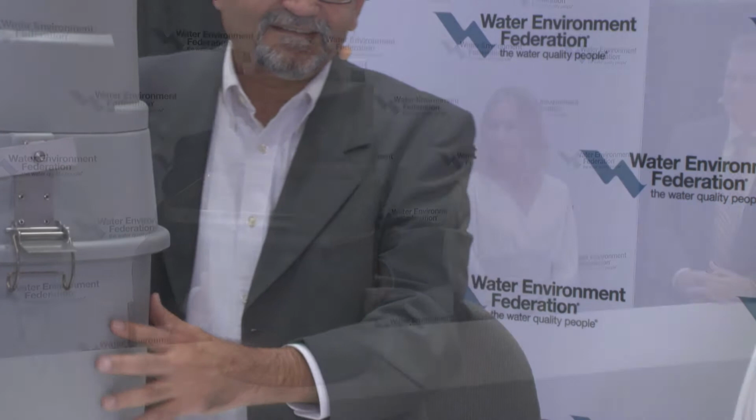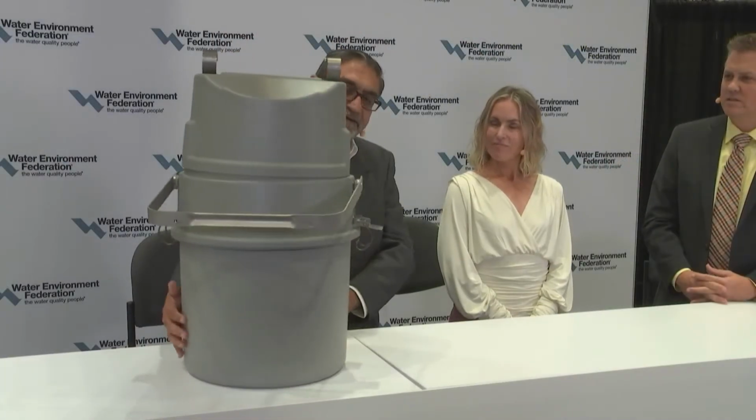There are different types of samplers available: portable samplers, portable refrigerated samplers, and permanent refrigerated samplers. For this program, portable samplers and permanent samplers were used. So I brought an example of a portable sampler just to show you. Let's take a look here. Yeah, so this is a sampler here.